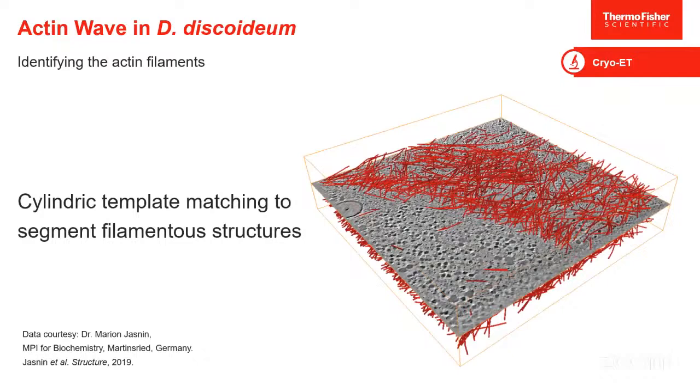But yeah, I'm glad Tianbo changed to this slide over here, because exactly what he was showing here could be applied to those filaments. If you're talking about the stereocilia themselves, they're a little bit more defined and easier to quantify if you can get a large view and segment all of them.